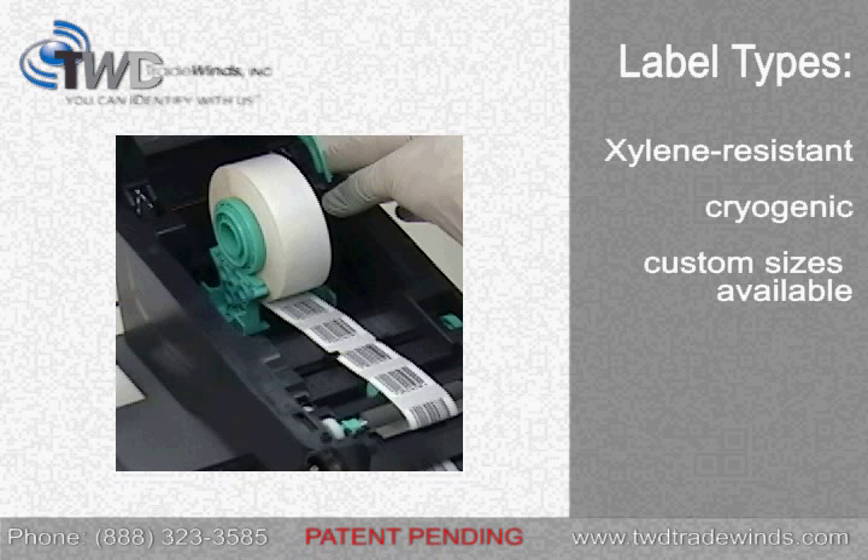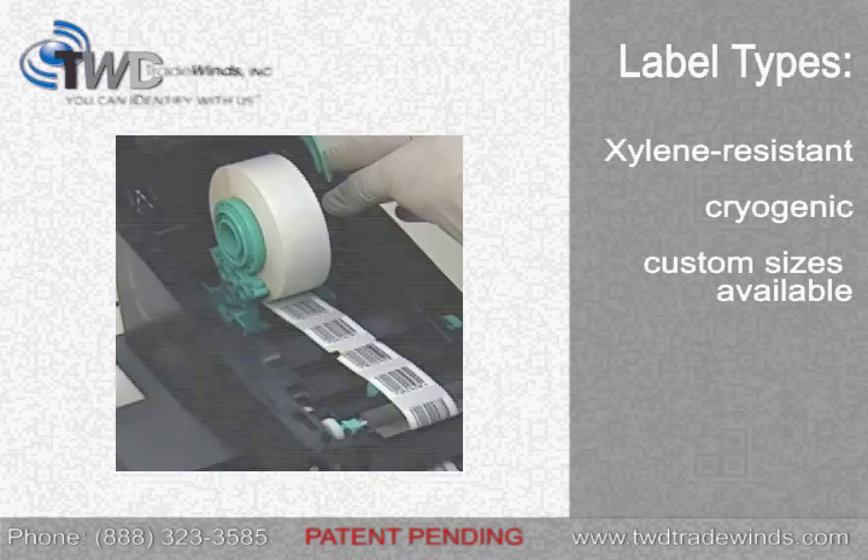Depending on your application, you can choose either xylene-resistant labels or labels ready for cryogenic freezing. Custom label sizes can also be quoted.